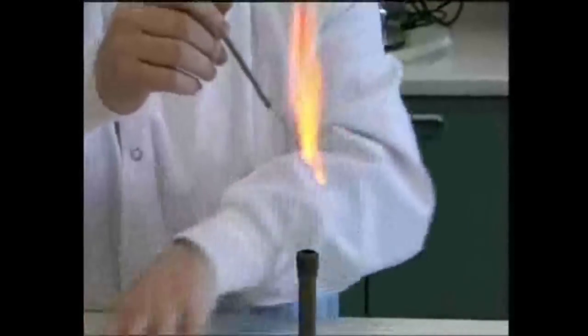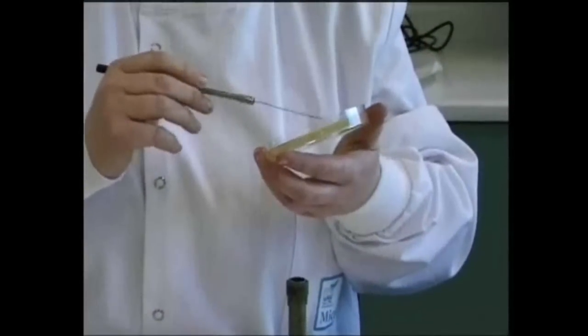Re-flame the loop, and pick up a very small part of a single isolated colony of your test bacteria, and mix it with the water on the slide to form a very slightly cloudy suspension.